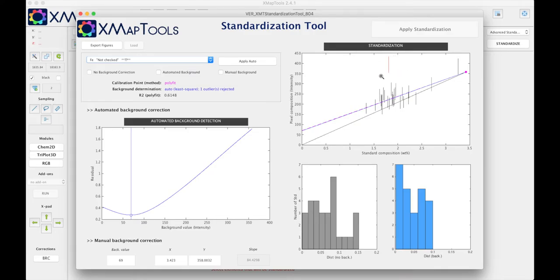This red guy is an outlier. In this automated background detection window there is a diagram showing the evolution of the residual, the residual being the sum of the distances between the spot and the calibration curve with the background value.